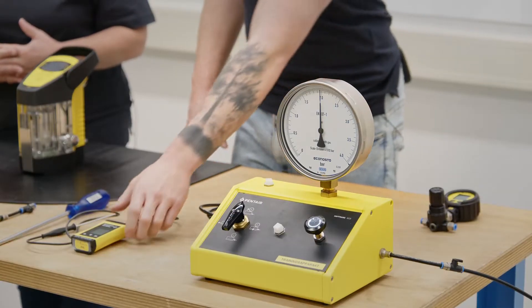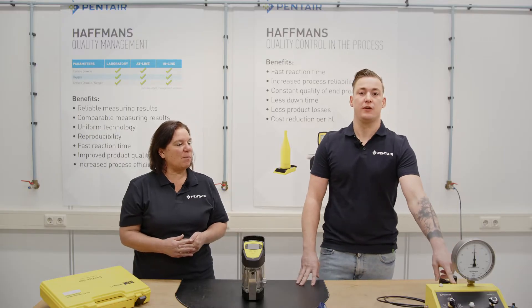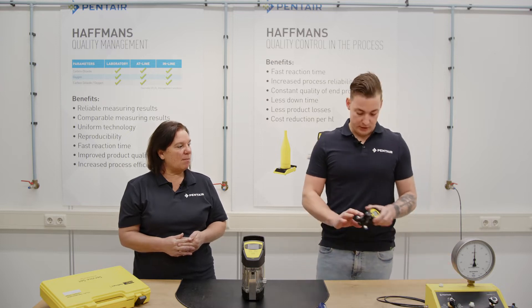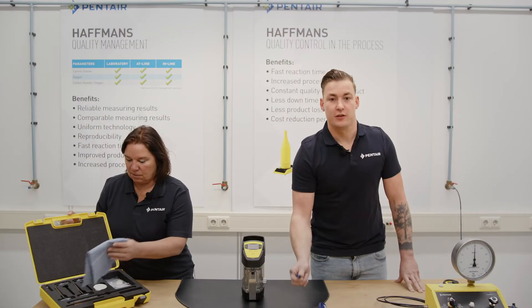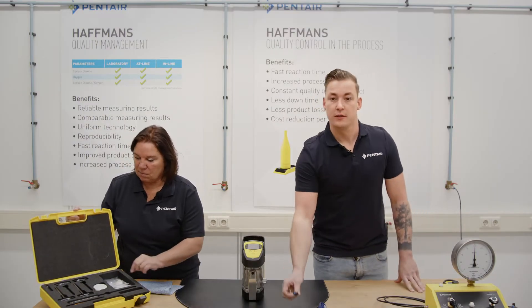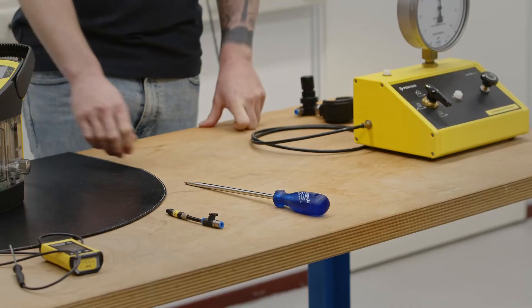We need a thermometer — we use a digital one — and a precision gauge, like the gauge calibration device. But when we go on a service job, we have the small precision gauge with us. Further the calibration bolt from the service set, air supply to create the calibration pressure, and also a big screwdriver.